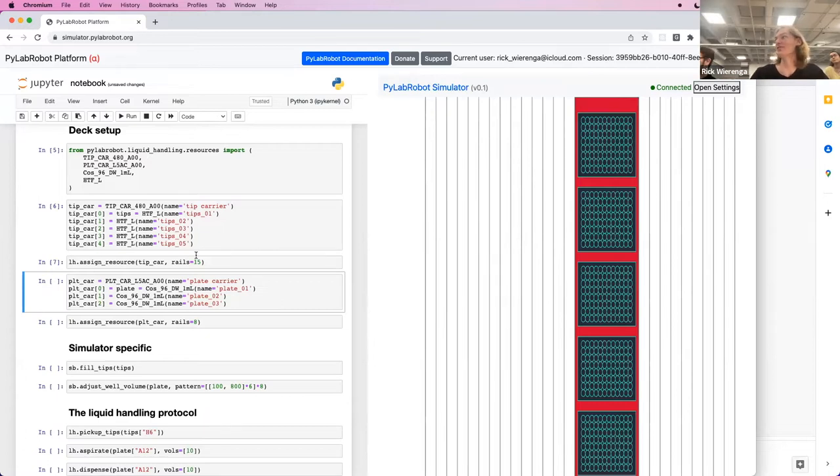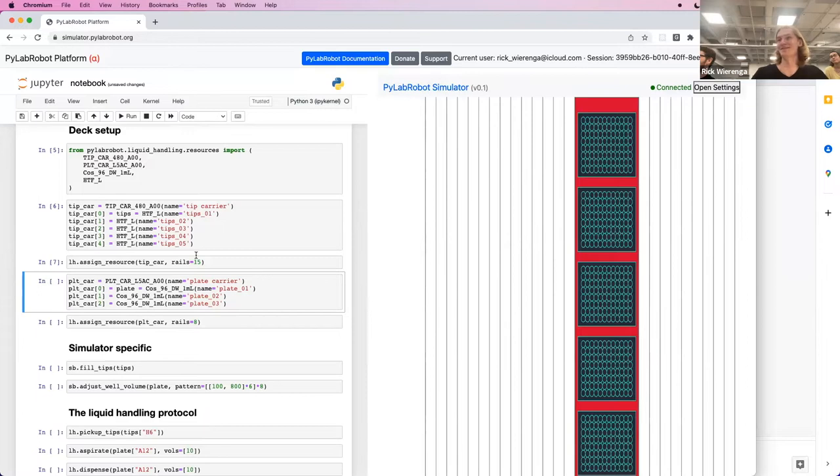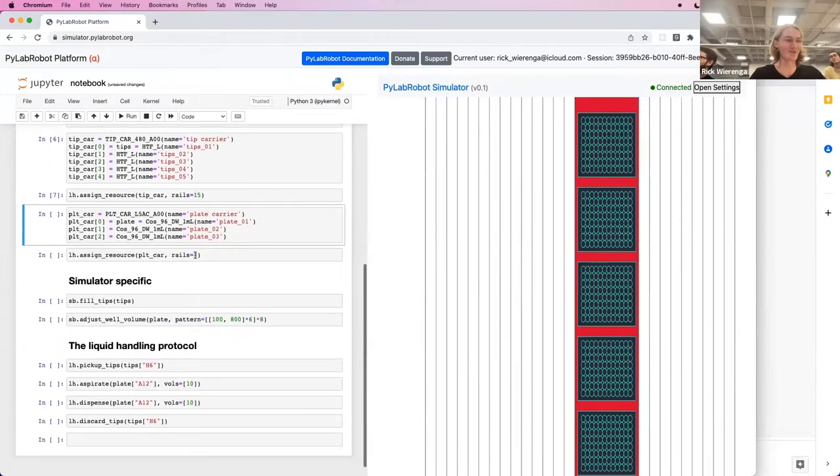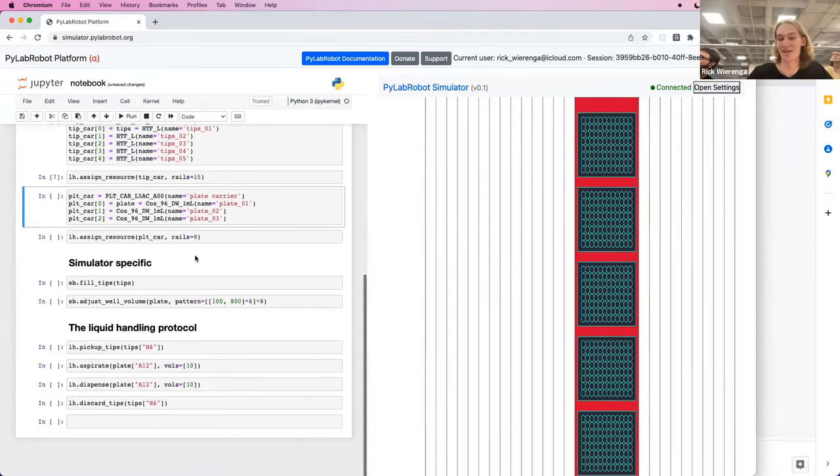On a real robot, you unfortunately cannot do this. You have to put in a resource yourself and then tell PyLab robot where the resource is. But in the simulator, we add them when you call assign.